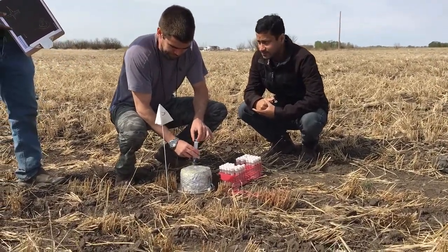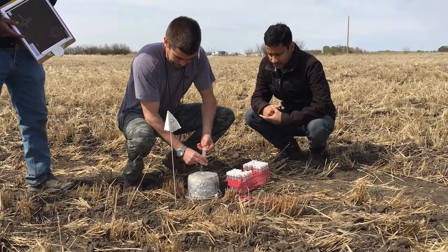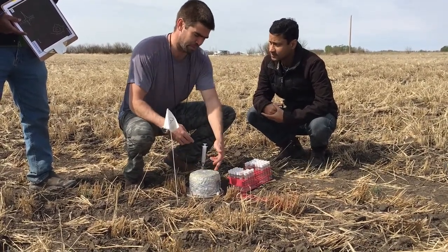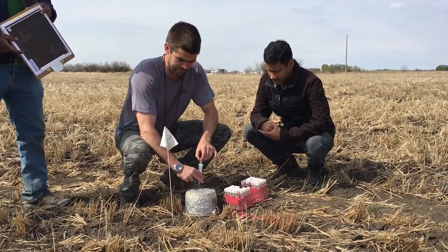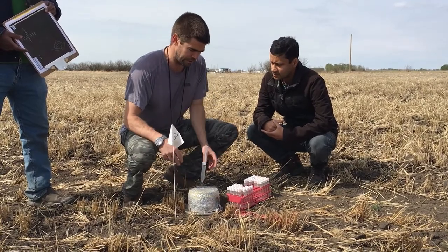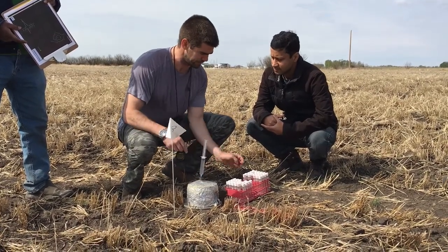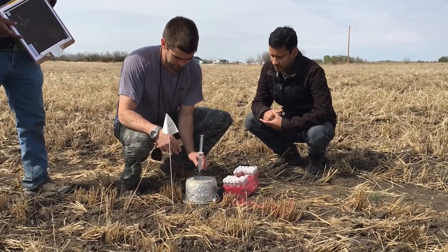I've done an atmospheric air flush, now I'm going to do a flush inside this chamber. We're going to take our actual gas sample — this pot's been sitting on here for 20 minutes. We're going to measure the nitrous oxide, the methane, and the CO2 coming off the soil here, for about 10 seconds.